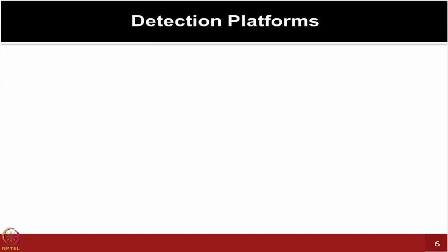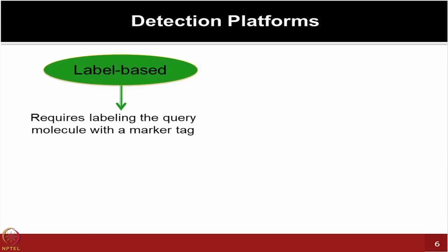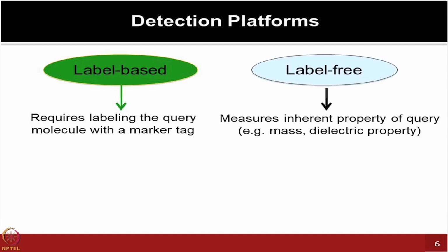You want to detect the signal after doing the assay, right, and that is where whatever you have hypothesized, at the end only by looking at the dots or looking at the curve, you know whether your experiment has worked or not. Therefore, you need some robust detection platforms, and to do that you either use some sort of label to follow your experiment and measure those labels with fluorescence based methods or chemiluminescence based methods. Sometimes even radioactivity based assays can be very powerful. So, you require some sort of label which could be used as a marker to follow your experiments.